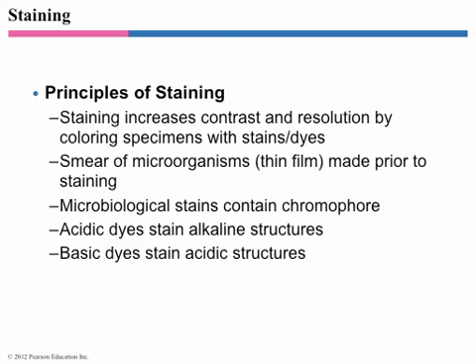The reason why the vast majority of stains that we use in microbiology, or any sort of biology to be entirely honest, are basic is because usually what we want to be looking at is something with a membrane. And the membrane is going to stain very well with basic dyes. It's positive, and it's going to stick to negative things.